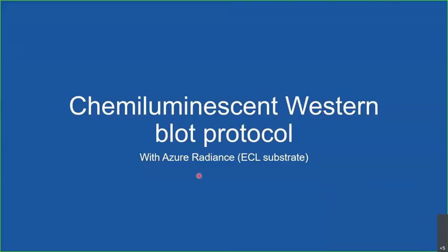Right. Let us walk through the chemiluminescence Western blot protocol. Here I'll be using Azure Radiance, which is an ECL substrate, as an example.